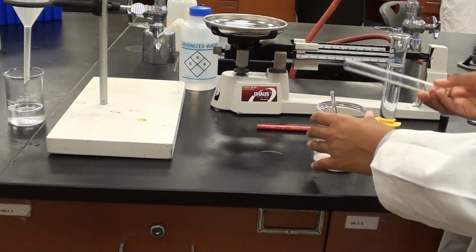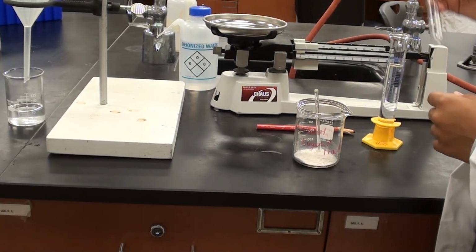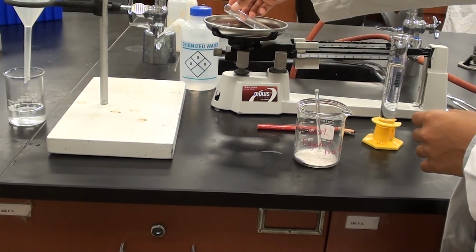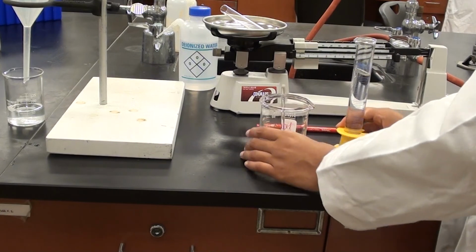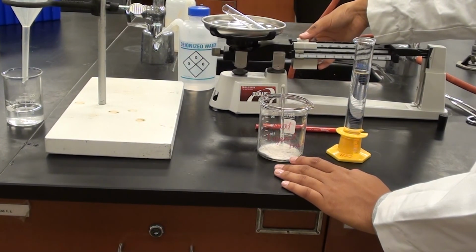Now it's not necessary to get every last skerrick out of there because she's going to weigh it, and the difference will be what we're interested in the beaker anyway. So any residue left in there will be taken account of because she is going to go ahead and weigh the empty test tube. And again, she'll be weighing that to 2 decimal places.